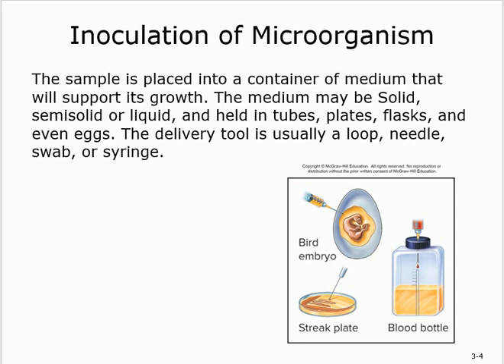Where are you going to put it? You can put it in a tube, a plate, a flask, eggs, anything. Most likely it's plates, but we will see.